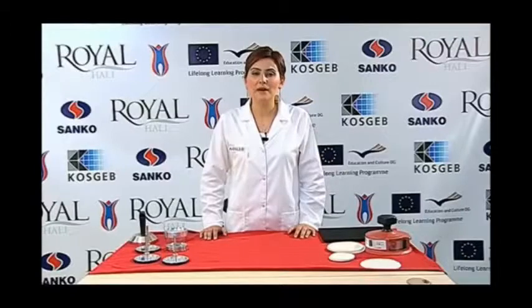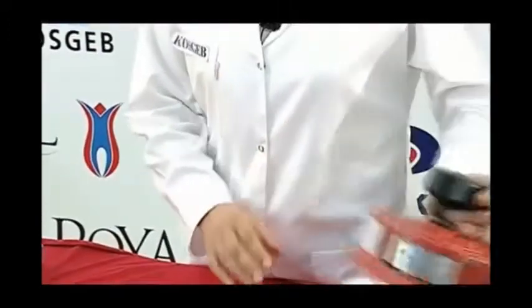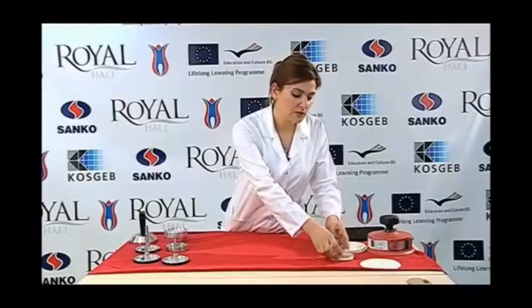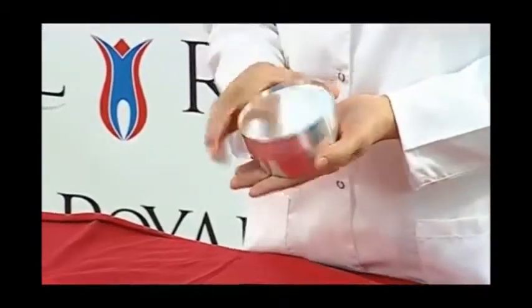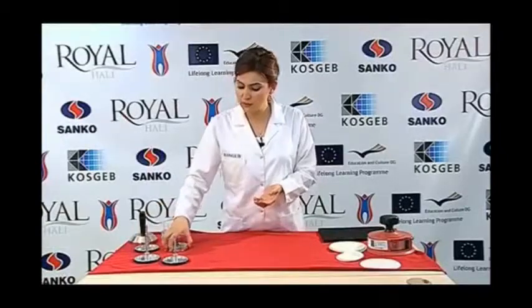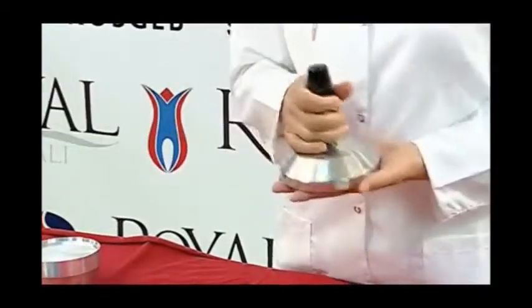In this test, we use the Martindale abrasion and pilling device. We need a 140 mm diameter sample cutter, 140 mm wide bottom felt, 90 mm diameter top felt, a holder apparatus for preparing the sample, sample holders, loading weights and a 2.5 kg presser foot to place the abrasive cloth.